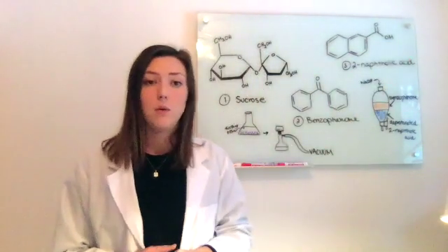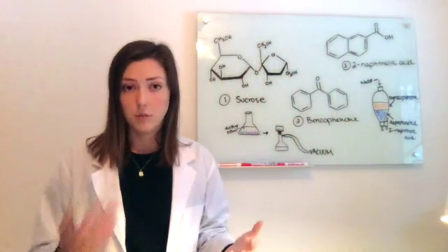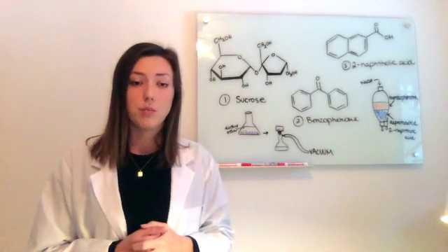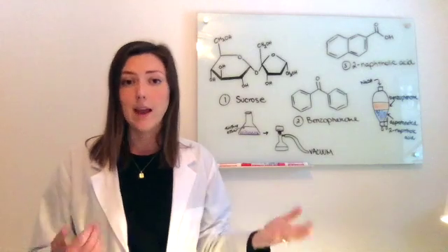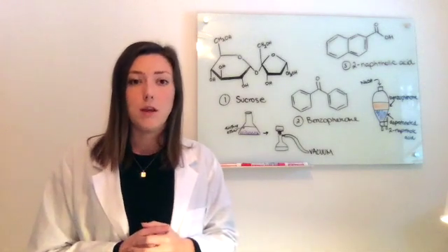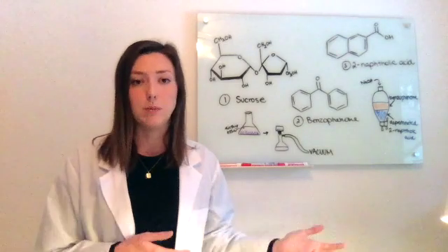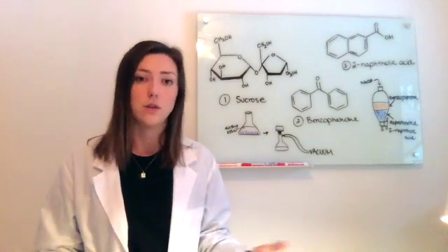Just in the way that we were able to separate an organic neutral from an organic base when we were using the washing and extraction example, you can also separate an organic neutral from an organic acid. The only difference is that instead of treating it with an acid in order to protonate it, you treat it with a base in order to deprotonate it and therefore force it out of the solution.